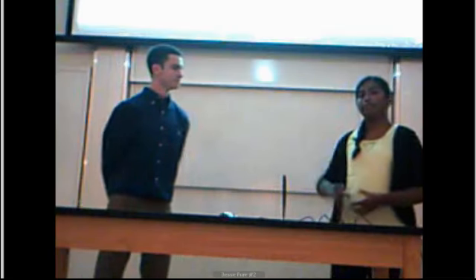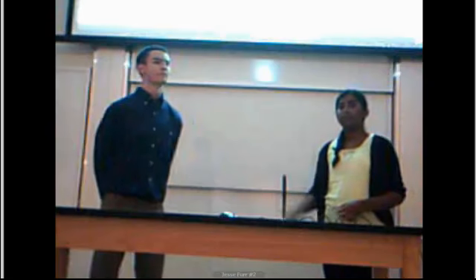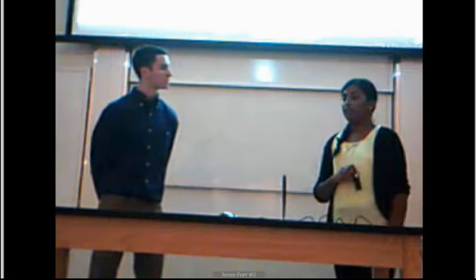First thing we did, we created a blank of acetonitrile because that's the solution that we put it in with, and so it wouldn't detect the acetonitrile, into this quartz cuvette right here. If you can see that, it's clear, and that's the fluorometer back there. And we put that in there first, and then we started adding the dilutions after we conditioned the cuvette, which basically means adding a little bit of it, shaking it around, and then getting rid of the solution. And we figured out what our LOD and LOL is.